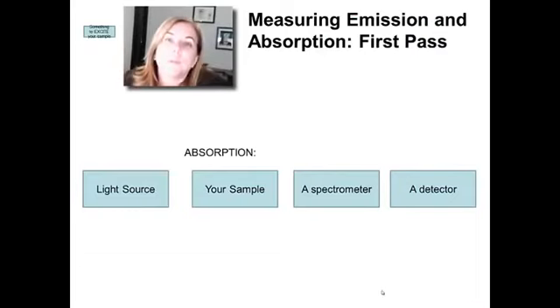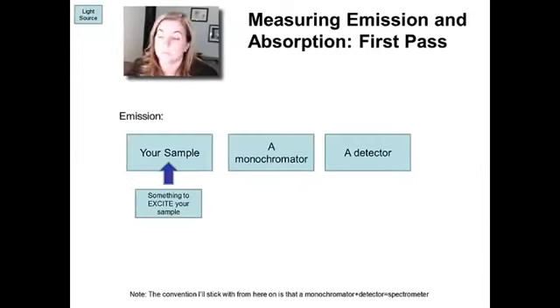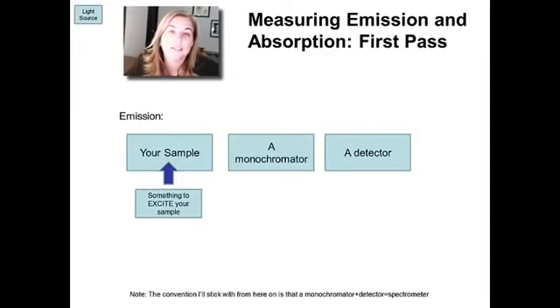So let's try atomic emission. How would this look different? Now, to do emission, you can see the answer here. It looks a little bit different than absorption. And the real difference is that in emission, you have to start with atoms in the excited state. So you've got to excite them somehow. And so the excitation source has to be present. Often that's not in line with the monochromator. Sometimes it matters, sometimes it doesn't.